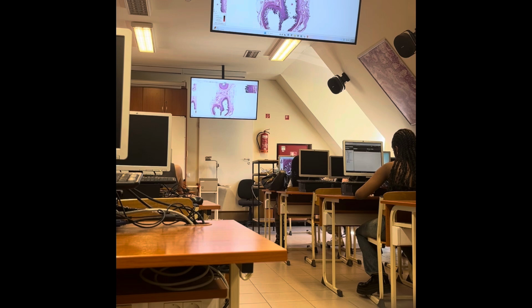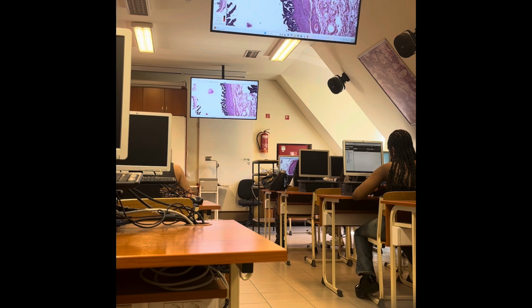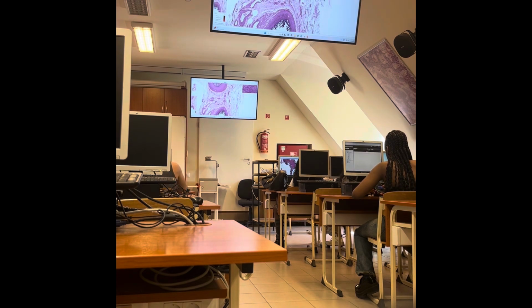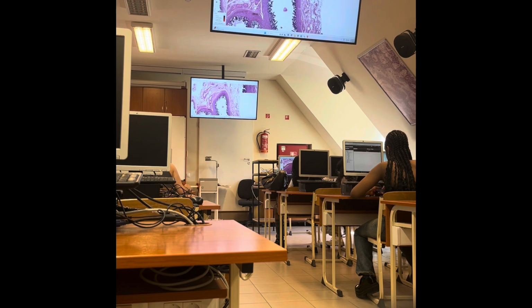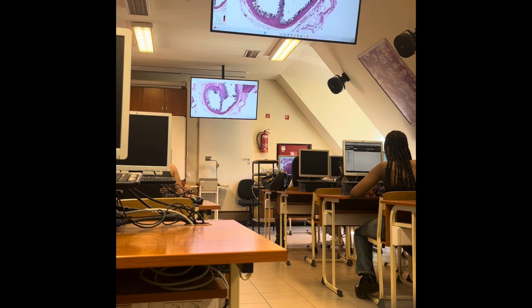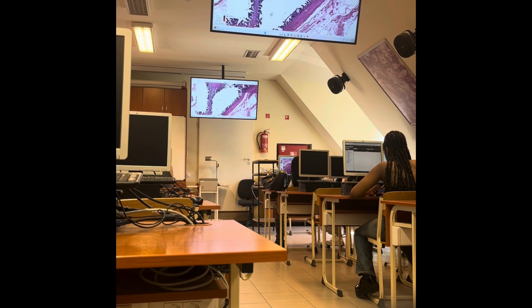The mucosa is also labyrinthine, so the connective tissue layer shows folds, the same as in the ductus deferens. But you can see, if I go back into this view field, that the muscle layer is obviously thinner in the case of the seminal vesicle. The layers are not so regular, but officially it is also an inner circular and outer longitudinal sublayer. Okay, but now let's see the mucosa.